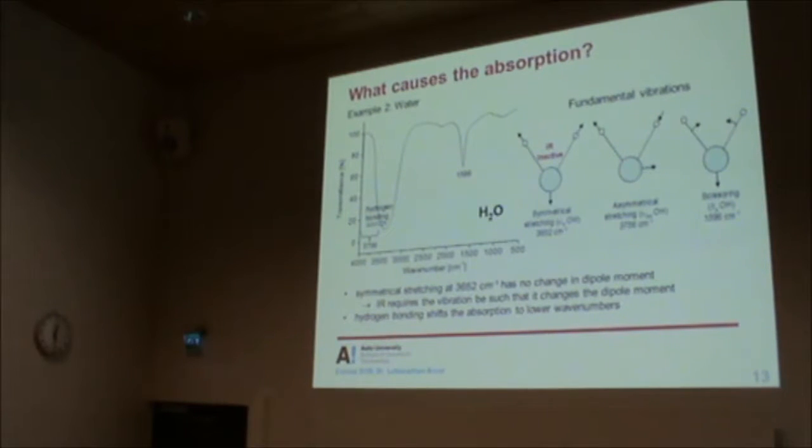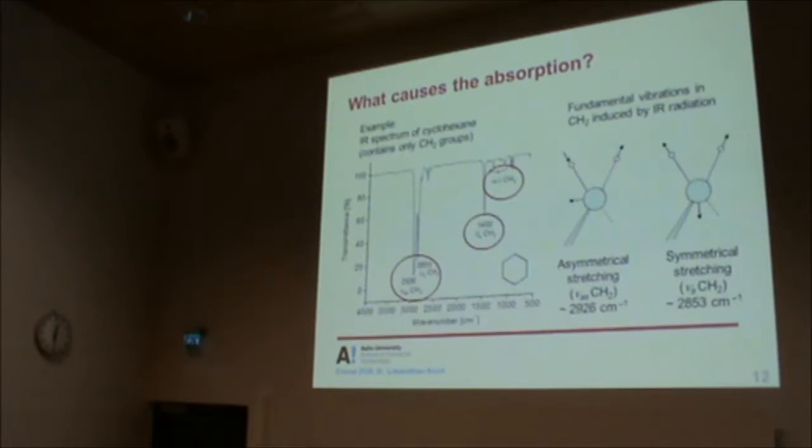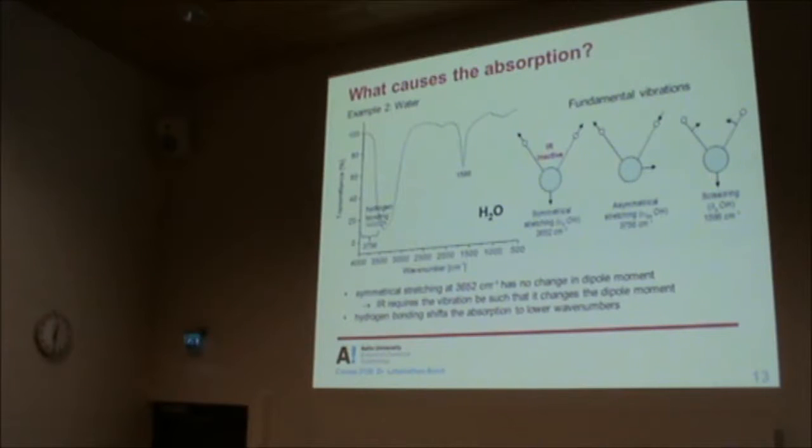One huge conclusion from this slide is that the OH stretch is very broad, very huge. Molecules that exhibit the CH stretch also show up in the same region, but CH is very sharp, and OH is so broad that if you have organic molecules with a little bit of water, you will lose this whole region.